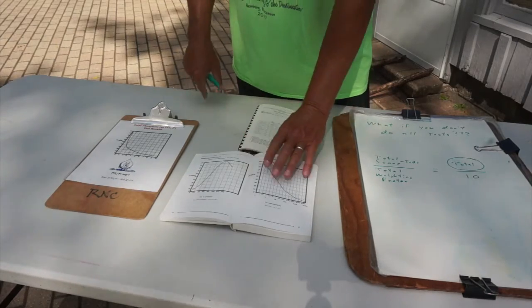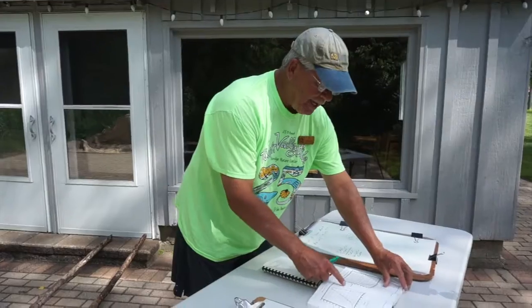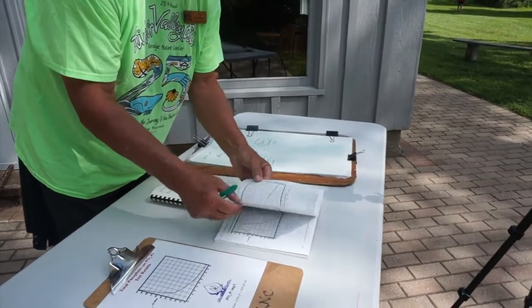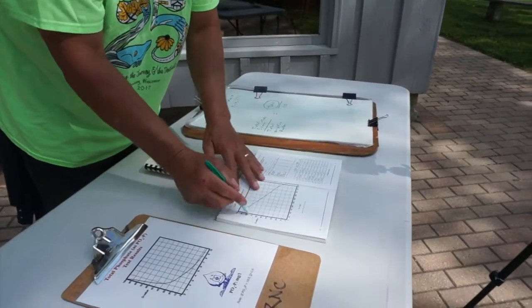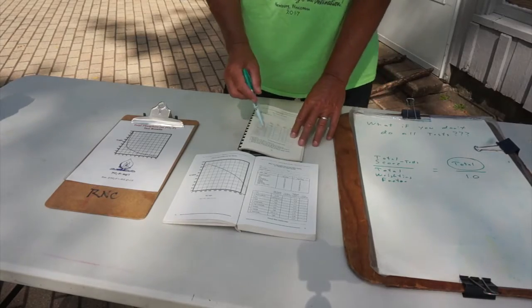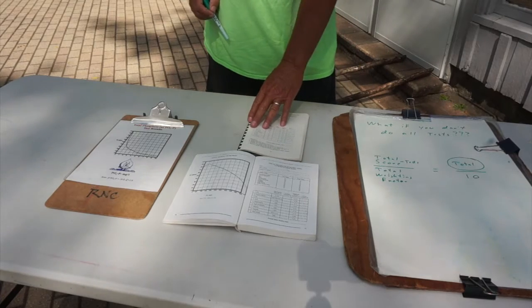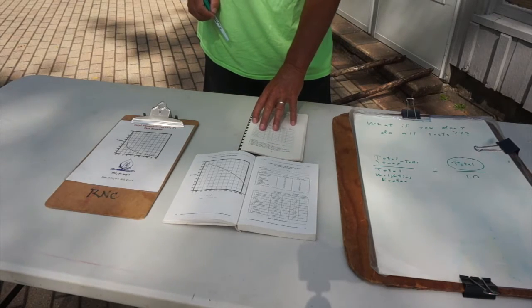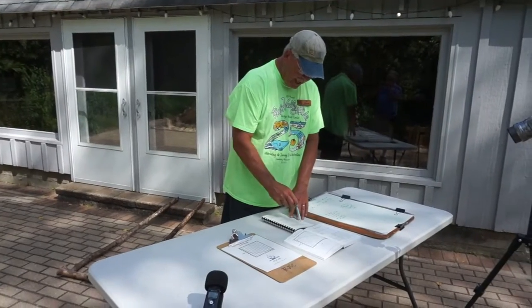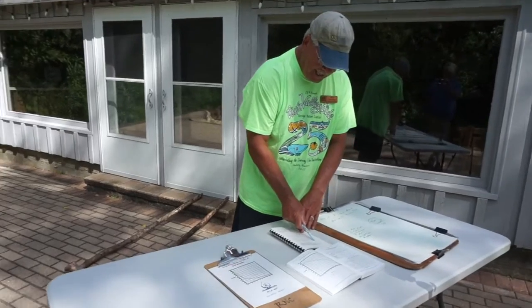Okay, now you've already gone through these 9 tests. Here they are, and I'm just going to page through here and show you these 9 tests that we're doing. There they are. You guys got all your data. You took your data, and now you had to transfer that into a data sheet here. When you transfer this into your data sheet, then what you're going to have to do is calculate what's called an overall water quality index.